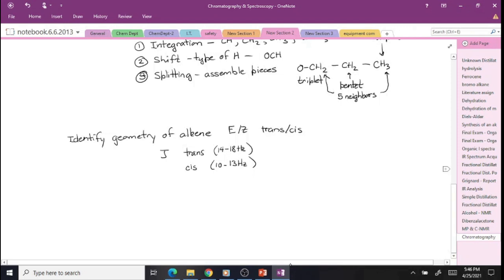If not, we might be a little concerned about our assignment of stereochemistry. But if they both tell us the same thing, then we can be fairly confident about that. And the second method is to use a calculated chemical shift. The delta, of course, means shift. And so we would want to use that formula that I again mentioned in the calculation discussion and do that for both the cis and the trans isomers and then compare that.